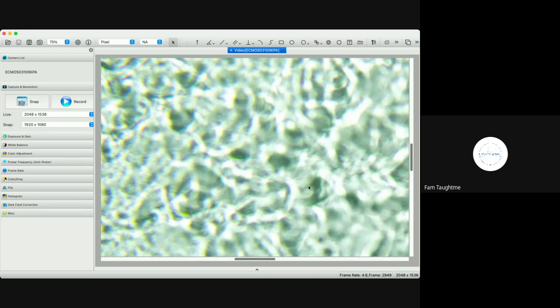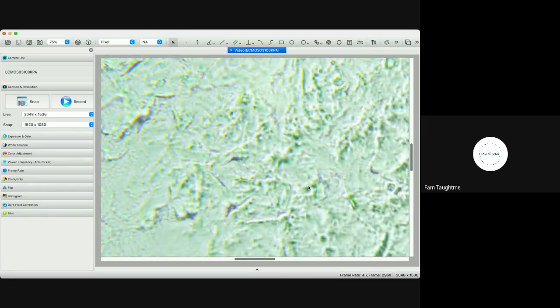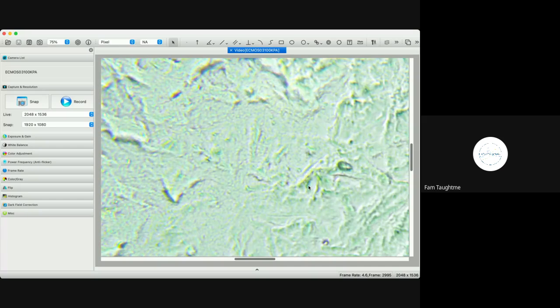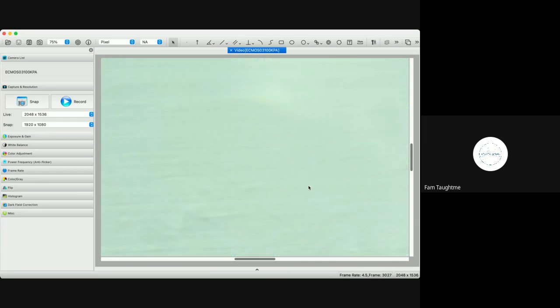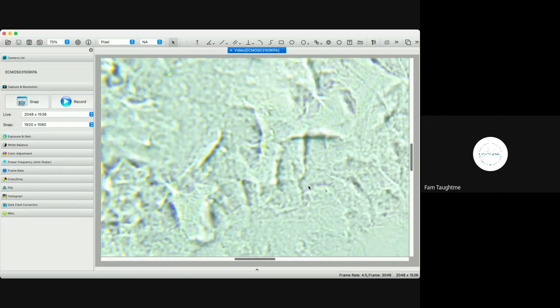It was really quite interesting, but I got used to it being part of my nighttime routine. I was just like, okay, I gotta go do my experiments. So this looks like lots more of that. Lots of mucin present in this slide.